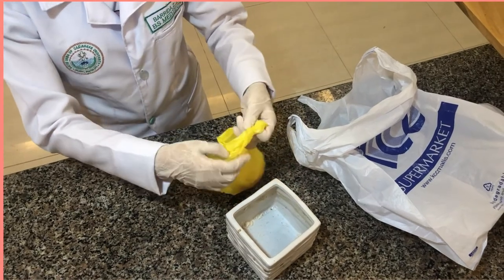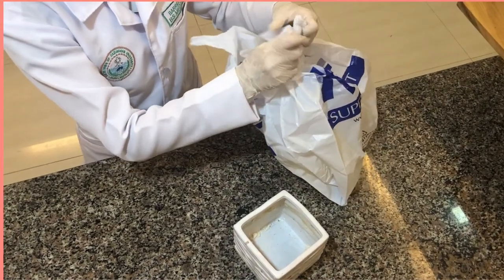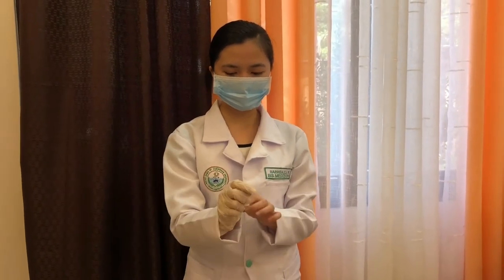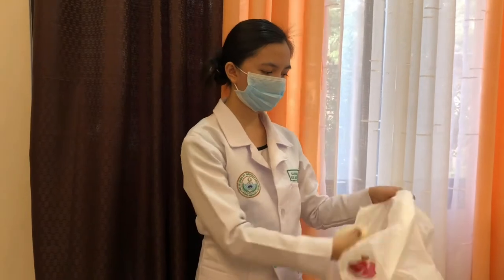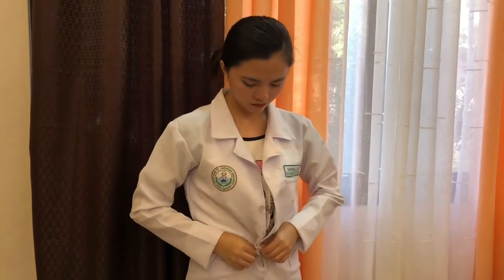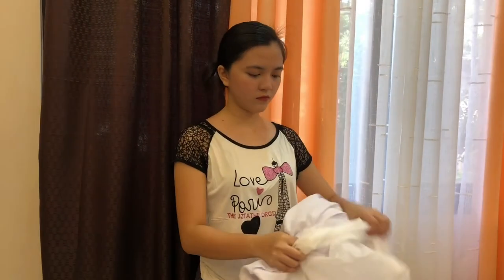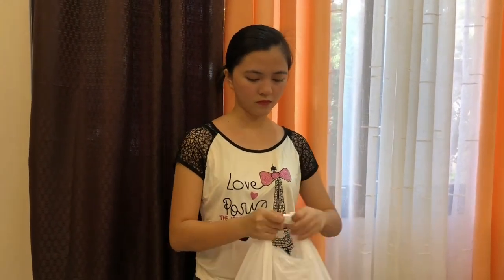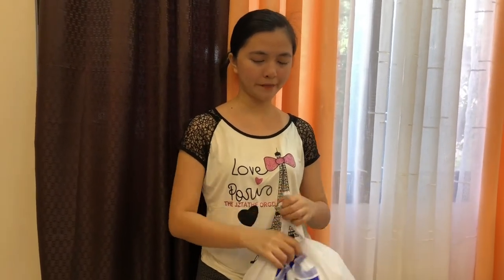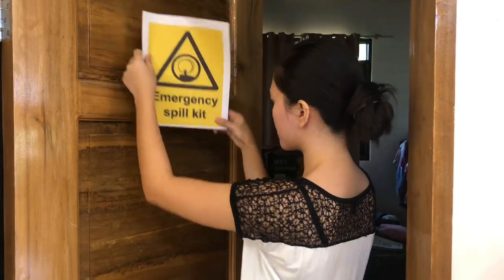Put the discard bag into another discard bag — what we call double bagging. Doff used PPE and put the discard bag into another discard bag. Put reusable materials in a different container bag. Decontaminate waste and autoclave. Remove the signage and prepare a report.